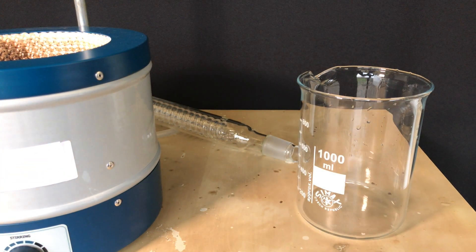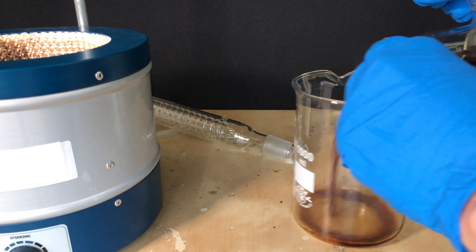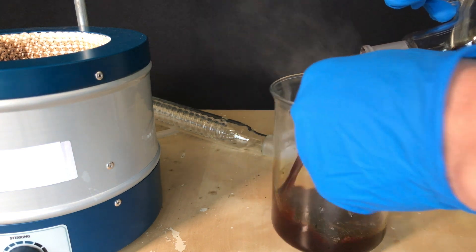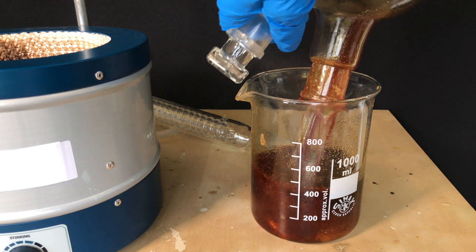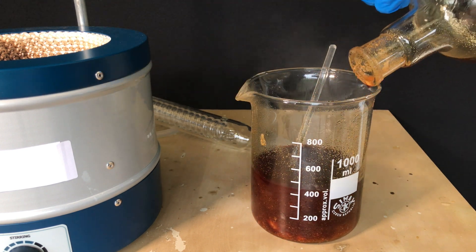We let the flask stand for about 15 more minutes to let it cool down. Then everything was transferred to a beaker. To get all of the powder over into the beaker, the flask was rinsed a few times using the brownish solution.